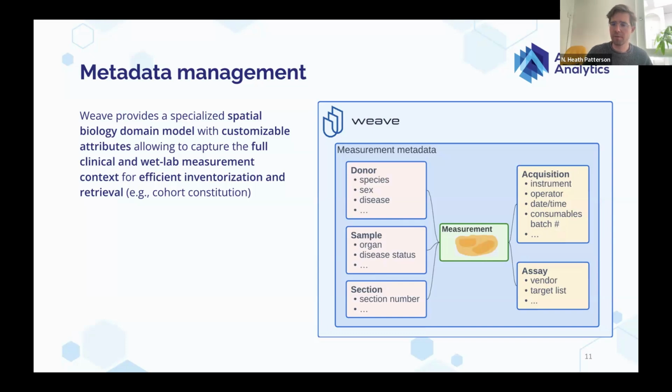And so once we have all of this, these can all filter into analyses. In some cases, that's obviously required. If you're doing disease comparisons, you obviously need that metadata somewhere. But it can also be used for useful checks of system functionality. For instance, QC over time of instrumentation is one area where this can also be used.